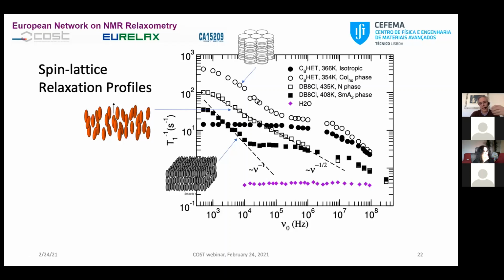If you use any other model, which is possible, then it is necessary for that model to be able to correlate what numbers come out of this fit with other physical parameters that you can obtain. In this case, I mentioned viscosity and elasticity in the elastic constant. It could be other parameters, I don't know, but that depends on the model.